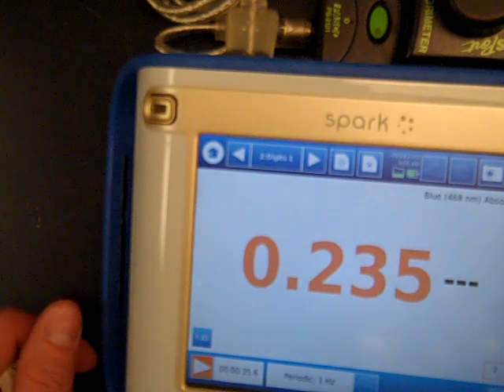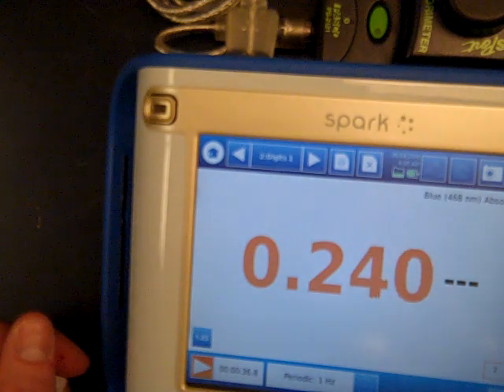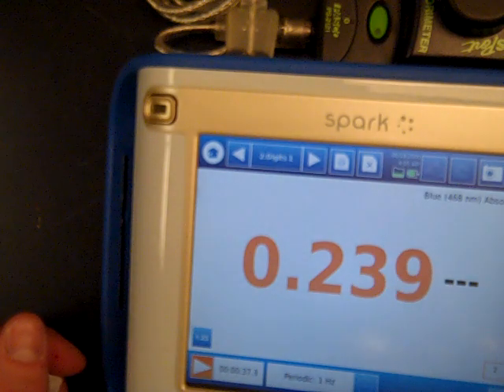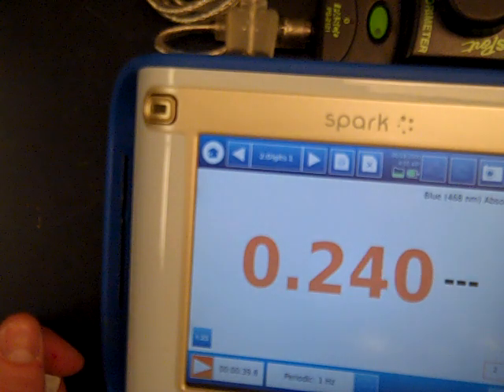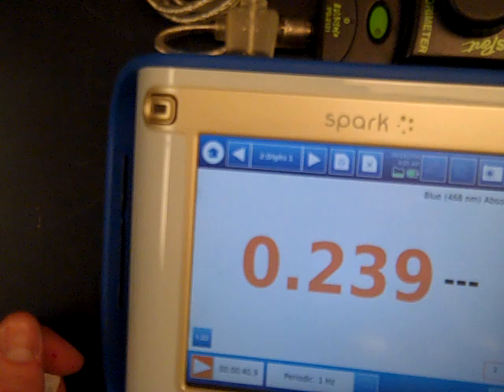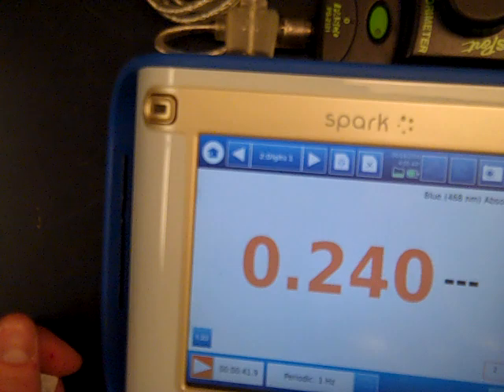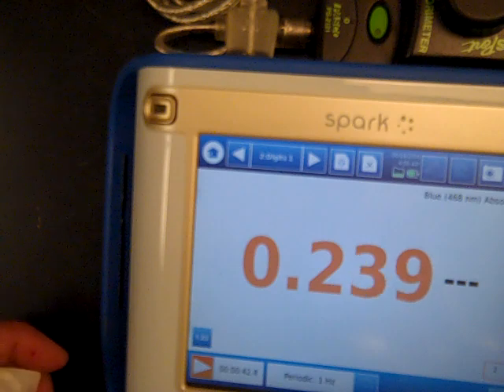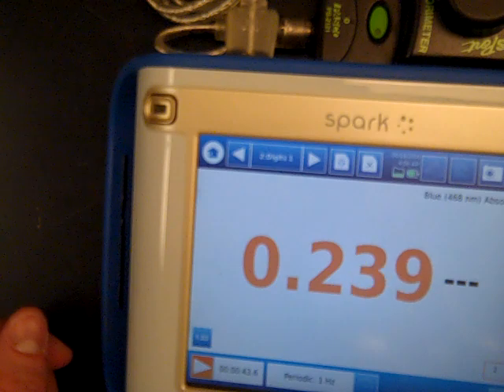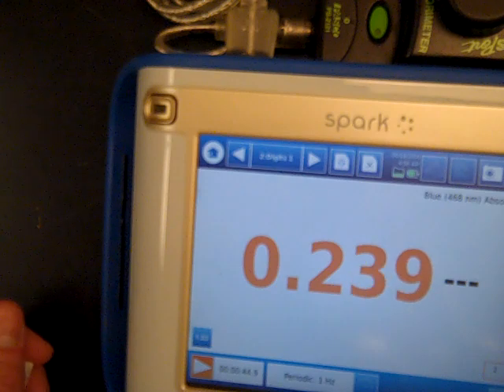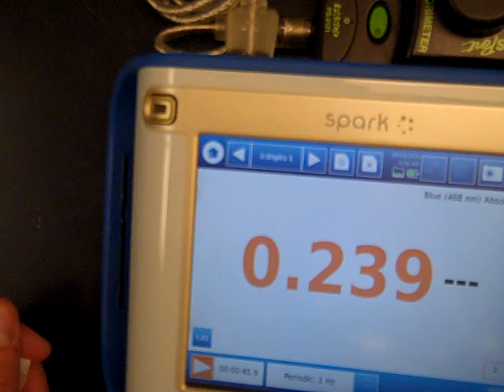For sample one, the reading is 0.240. It will fluctuate a little bit, but I go with the initial reading, so I'll record 0.240.